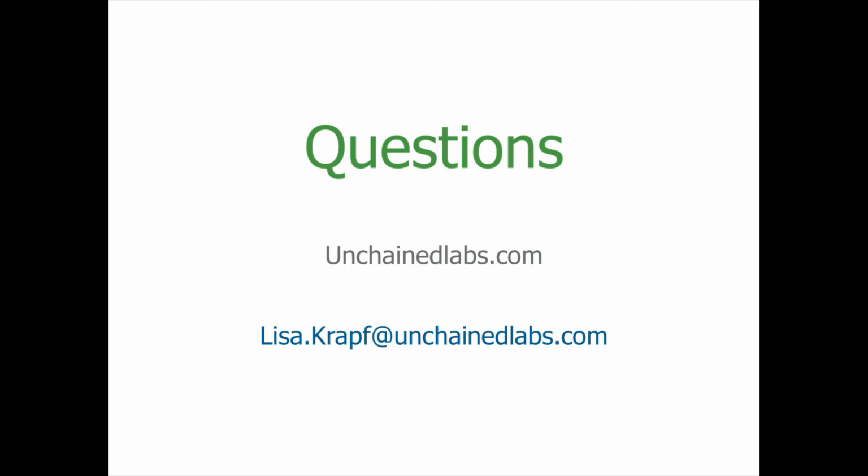Okay, great. Thanks, Lisa. So the first question is, are there ways to do particle analysis for a combination device?